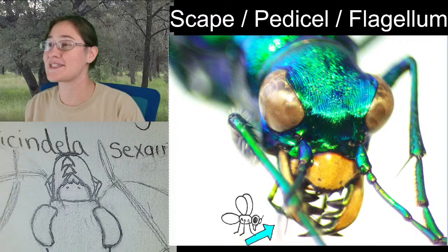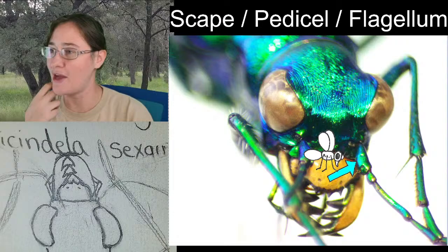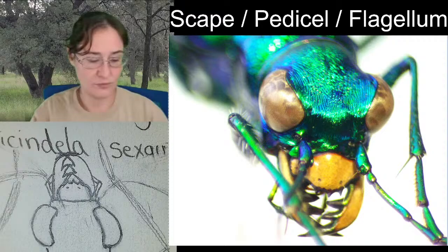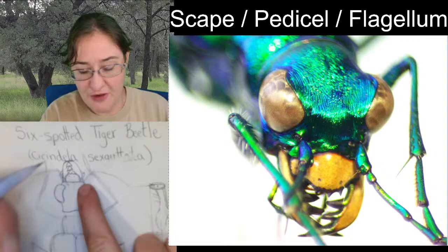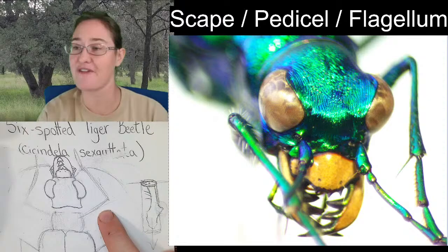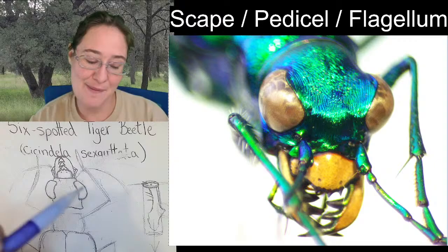So the scape is the first segment of the antenna, Terriel pointed out. It's right about here. Then we have this next one that's a little bit shorter. This is the pedicel. And then the rest of the antennal segments together are considered the flagellum. So from about here, a lot of times when I first start sketching my antenna, I will just sketch the scape and the pedicel, and then the flagellum I will actually wait to sketch until after I have my legs sketched, because I like to draw the antenna at the end. I think that it helps me with the length of the legs when the antenna aren't in the way.